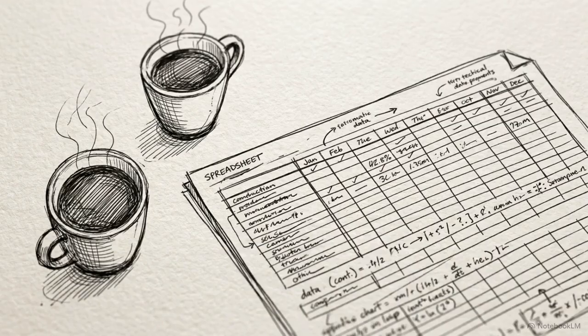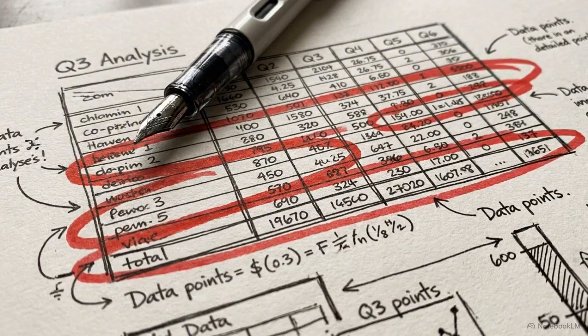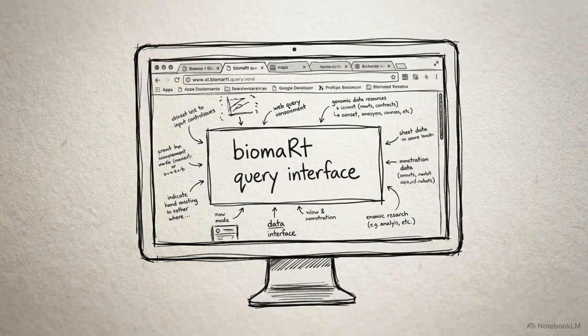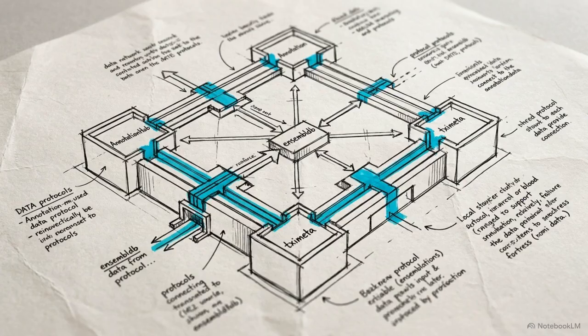If you're pulling a quick CSV file of top hits for an afternoon lab meeting, a few dropped gene names won't ruin your day. But compare that to combining 5 different clinical data sets for a multi-omics meta-analysis on FSHD, targeting a high-impact journal. You have to decide how to build your pipeline. You can use the quick, legacy lookup functions scattered across older coding tutorials, or you can invest the time to build a rigorous Bioconductor architecture.